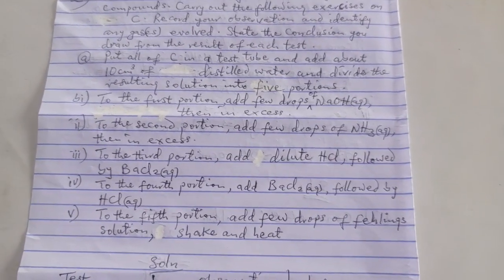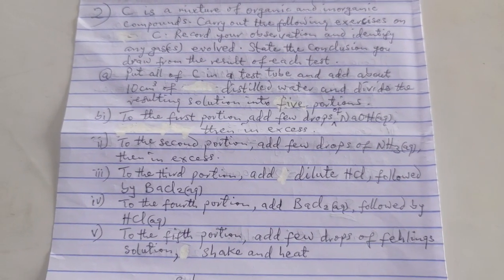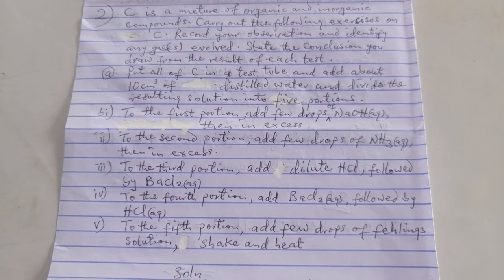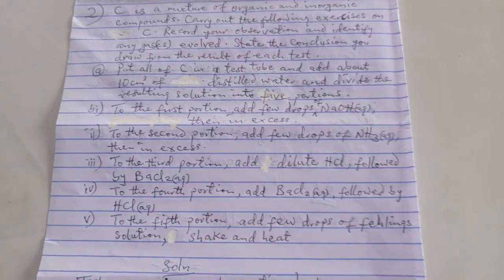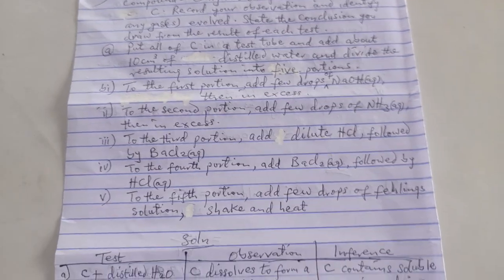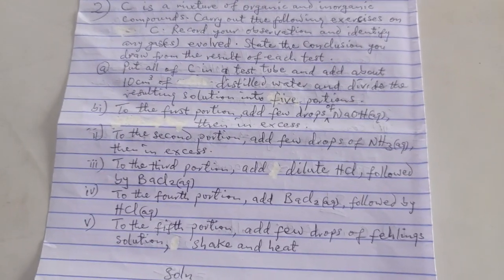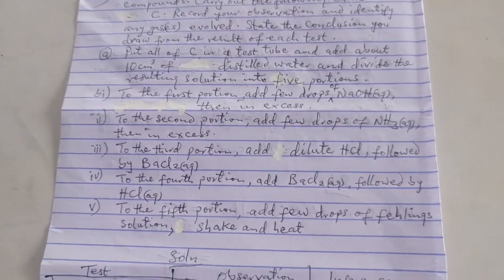Then when you go to the third portion, they said dilute HCl, then followed by barium chloride. Dilute HCl and barium chloride, you use to test for anion. Then the last one, when they said Fehling's solution, you use Fehling's solution and heat to test for glucose.